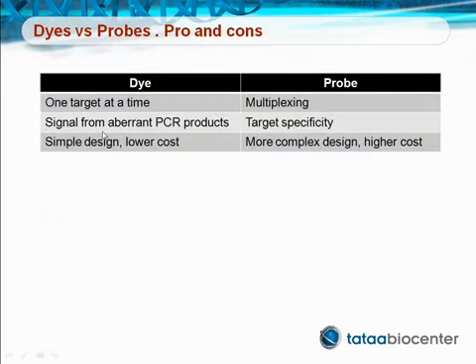A major advantage of the dye reporter is its less complex design and lower cost. Dye-based assays are usually run using conventional 3-step PCR, while assays based on hydrolysis probes use 2-step protocols with combined annealing and extension steps. The loss of design flexibility may in some cases be a disadvantage.